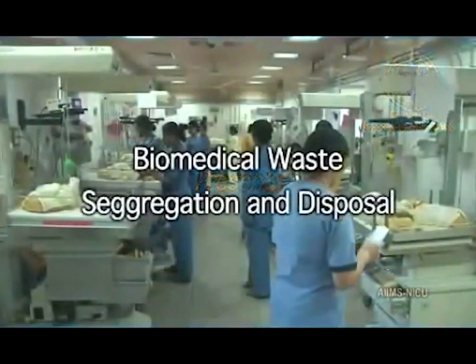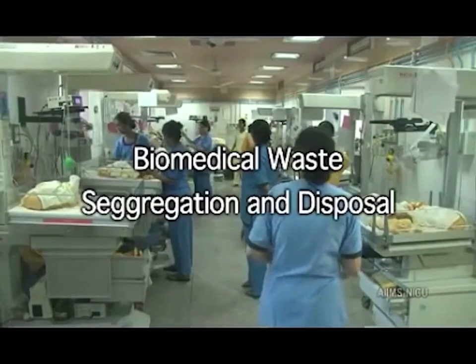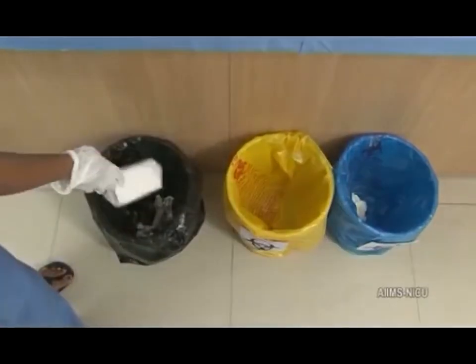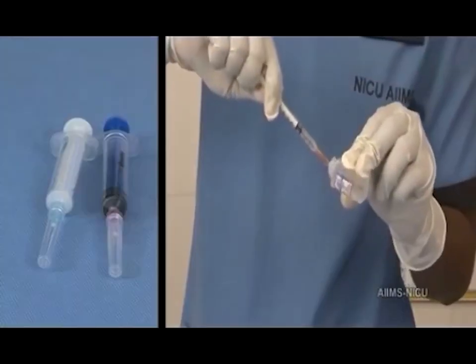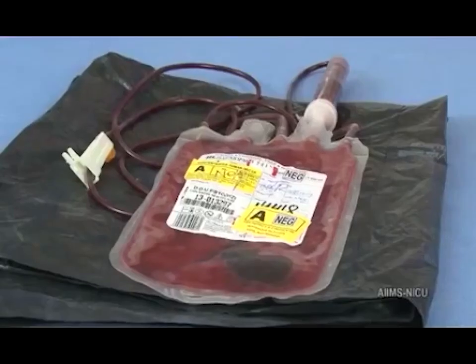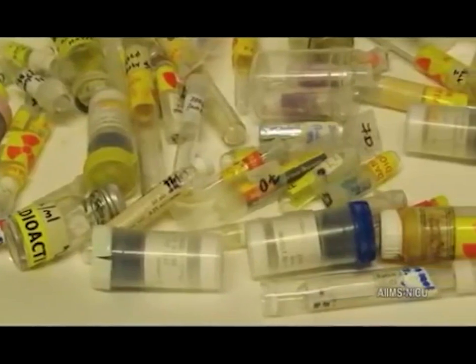In this video, we shall learn about biomedical waste segregation and its disposal. Waste is generated by healthcare activities and includes a broad range of materials. These are used needles and syringes, soiled dressings, body parts, diagnostic samples, blood, chemicals, pharmaceuticals, medical devices, and radioactive materials.